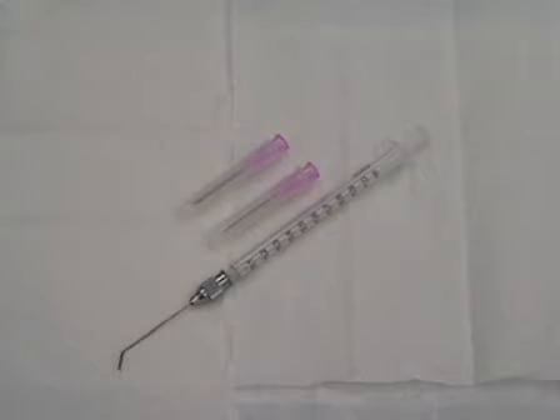Eighteen gauge needles are used to slice the epididymis open so that the sperm can swim out into the nine percent milk solution in the petri dish. Once confluence is found, the sperm and nine percent milk solution are taken up by a 22 gauge needle which is blunt ended and at a 120 degree angle. This is attached to a one milliliter syringe and then 0.025 milliliters is injected into the female.